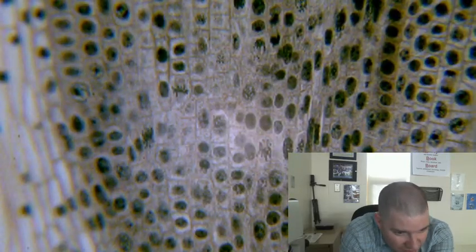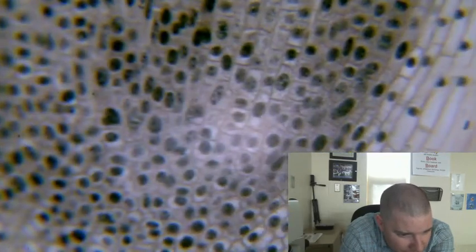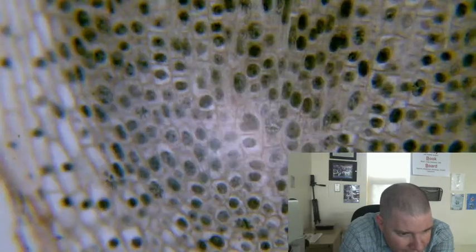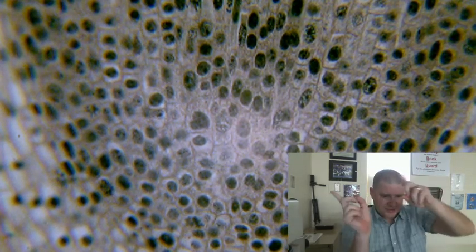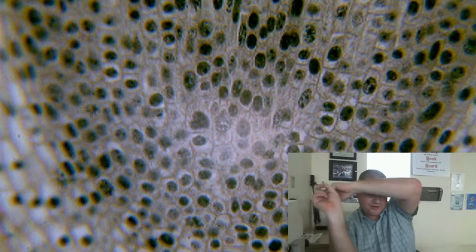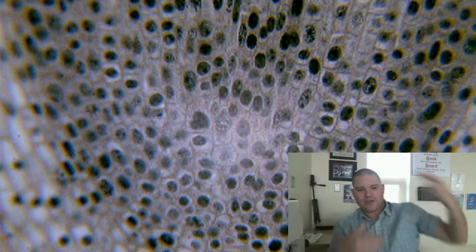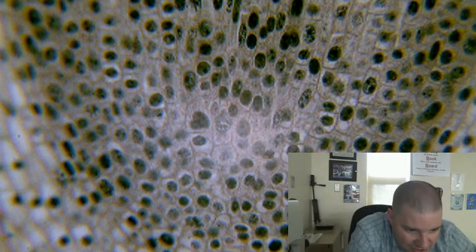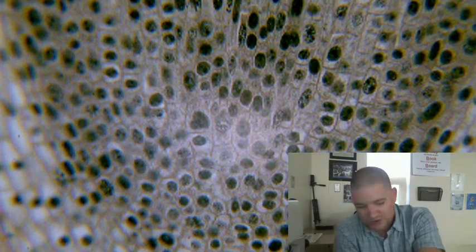So to get a good snapshot of what a telophase would be, maybe we'll have to go towards the end here. All right, there you may see a couple of them going on there. Let's see if we can hit one of them up. All right. Found one there. Good. So if you look towards, let me get my right there, if I'm pointing correctly, you can kind of see two nuclei in one cell. That would be a good picture of a telophase. But you can almost see that they're already starting to go back into interphase and start the whole cycle over. So it's just really difficult to find a good one there.